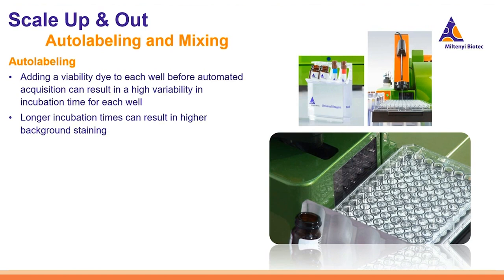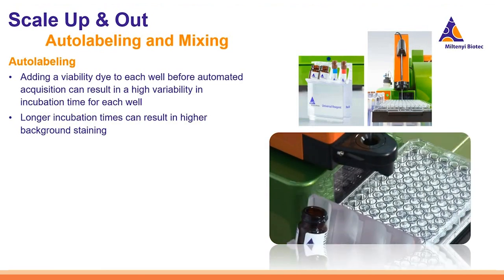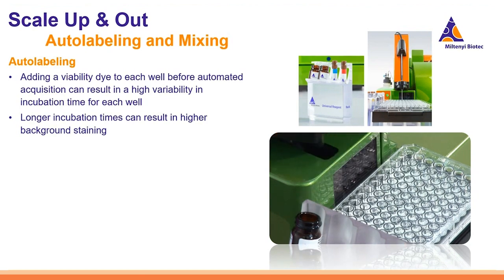5 minutes before acquiring. It is smart enough to actually add PI and stagger those addition times to make sure that every well has the same 5 minute incubation. So it does know how long to wait before adding the viability dye to each well to ensure it has enough time to acquire the samples before it, and also ensure that every well has the same 5 minute incubation. So a great way to use technology to automate our workflow and give us a more standardized incubation time when it comes to things like viability dyes.